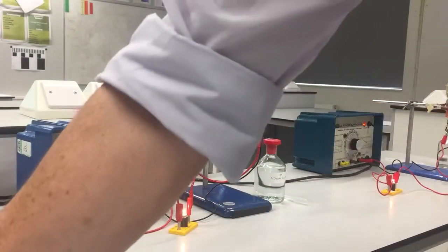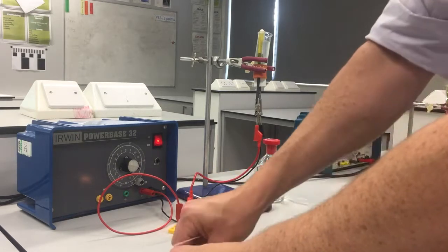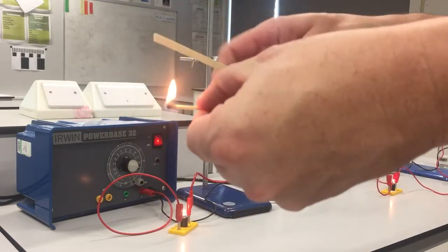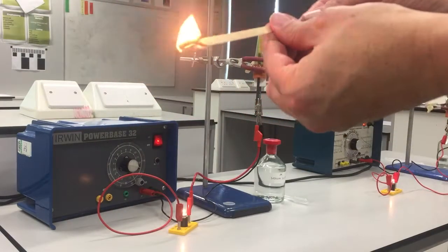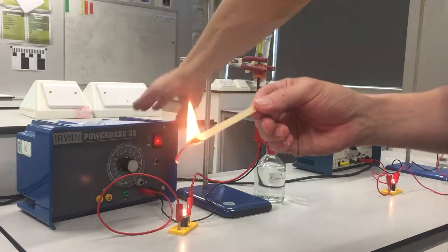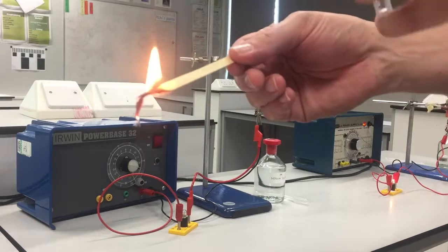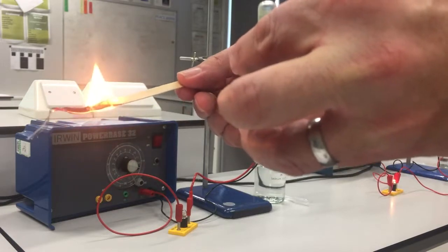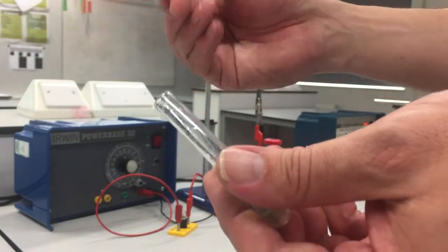So now we're going to do the other tests. For the first test, we're going to light a splint, and we're going to take the hydrogen. Now hydrogen is less dense than air, so when we take the tube out, we can just keep the tube upside down. We use a lighted splint, and we have to say lighted splint. Candidates won't get a mark for saying use a match. Okay, and here's the hydrogen. It's upside down because it's light. All I have to do is turn it right way up and put the splint at the surface, and we get the squeaky pop. And I have to say squeaky pop.